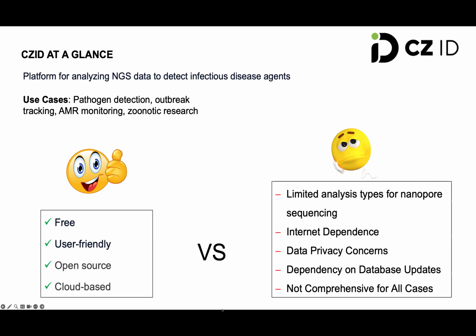So let me now guide you through the analysis using this program. I will stop sharing my screen for now, and share with you now the setup.